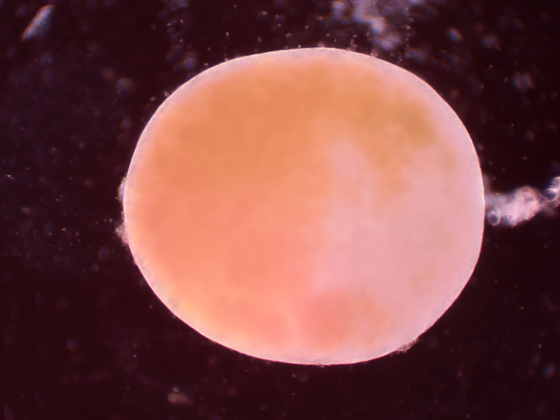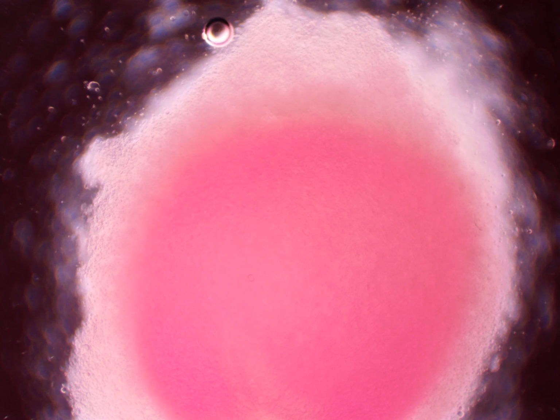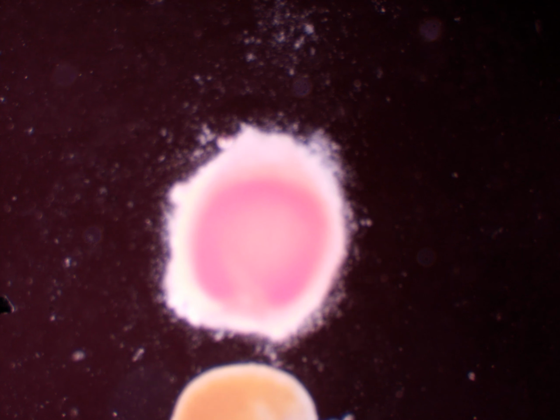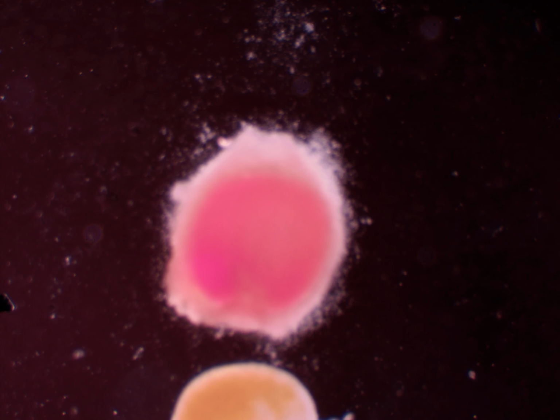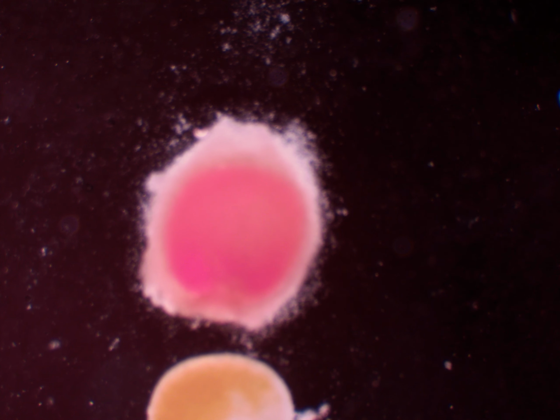So this was almost a bacterial infection of these eggs, which I haven't seen a bacterial infection under a microscope before, and I don't look at eggs that often under a microscope either. But this is an interesting occurrence since it's in salt water to have this high of a congregation of bacteria.